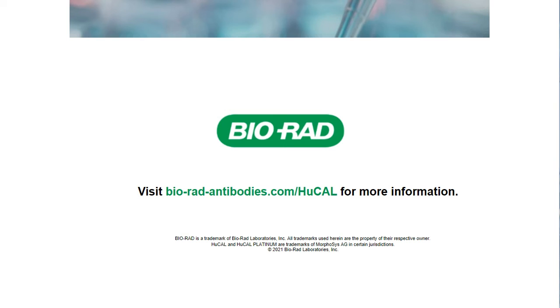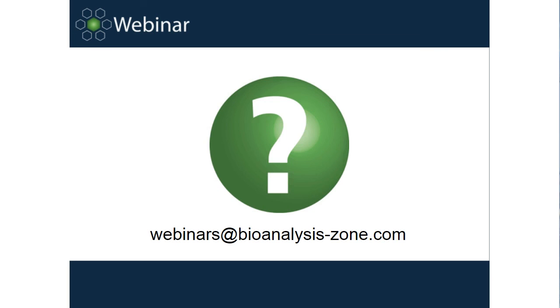Okay, and how long does the process take in terms of time? So assuming we have all of the antigens we need in-house, the workflow is typically 8 weeks for the actual library screen process. But obviously, it depends on what additional services are ordered with it as well. There's more to it than that.